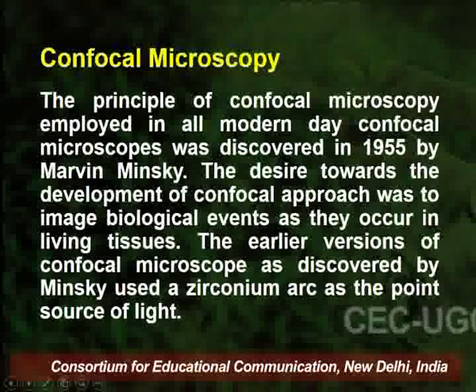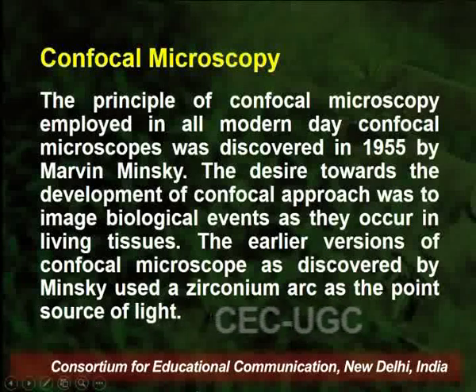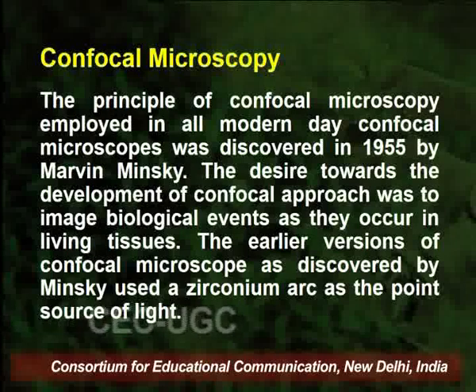So the principle of confocal microscopy employed in all modern day confocal microscopes was discovered in 1955 by Marvin Minsky. The desire towards the development of the confocal approach was to image biological events as they occur in living tissues. The earlier version of the confocal microscope by Minsky used a zirconium arc as the point source rather than laser beams.